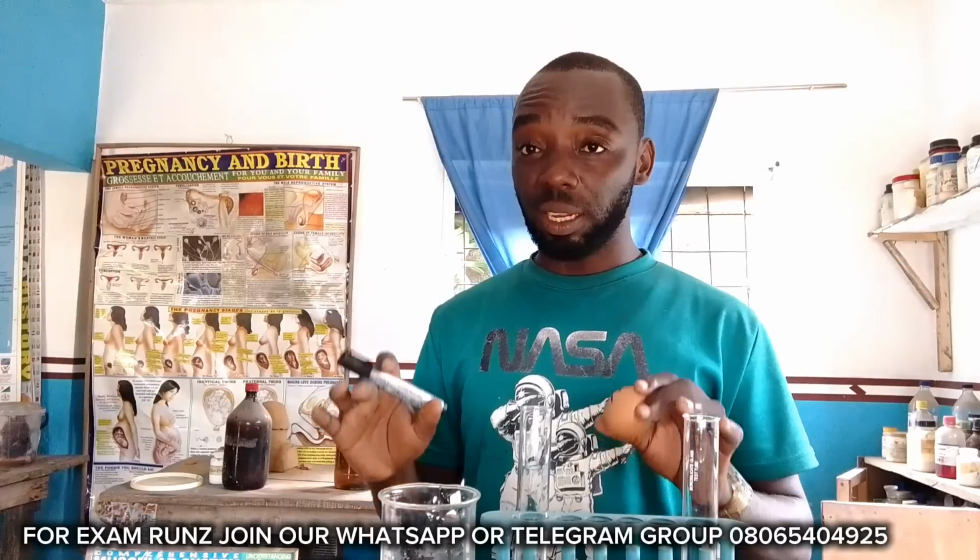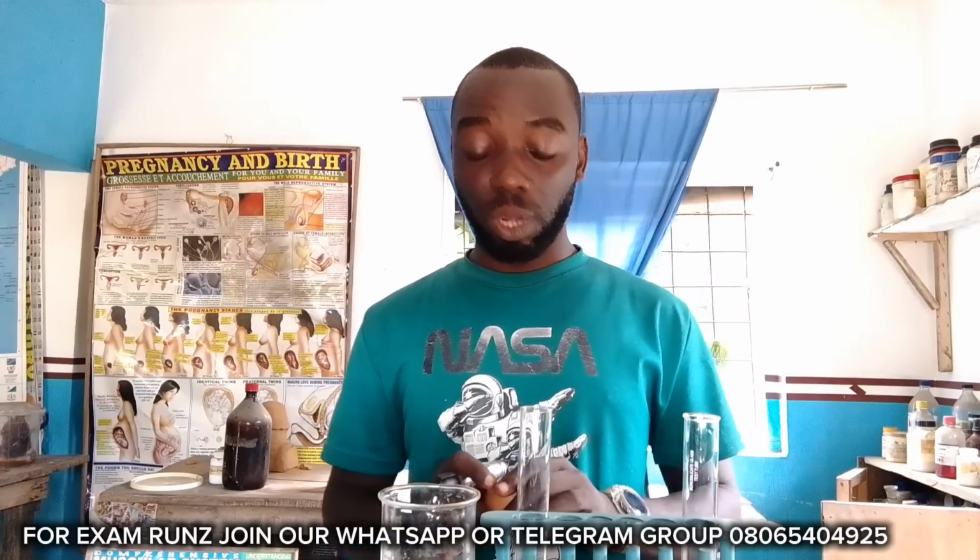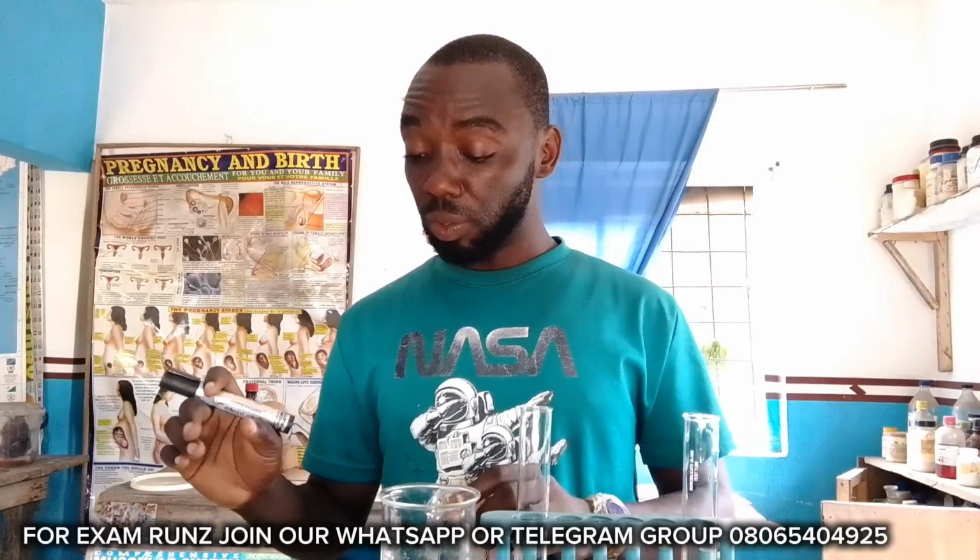If you look at this very well, you will discover that the test using sodium hydroxide, copper sulphate, and a protein is known as the Biuret test. So that is what we are going to carry out at this moment.